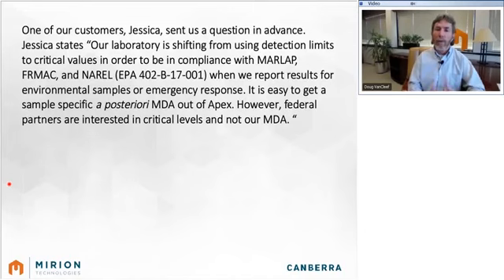It is common to report the nuclides as found, and then it is also common to report the MDA, even though it may be inappropriate for the measurement. It is common to report the MDA perhaps for all of the nuclides in the library or all of the nuclides in the statement of work or something like that. So you may be getting an MDA report that includes everything you might have looked for, while on the NID report, you're only reporting what was actually found. I hope that answers that question.